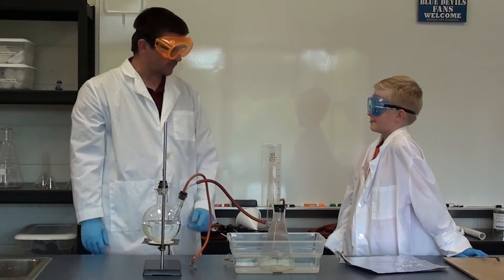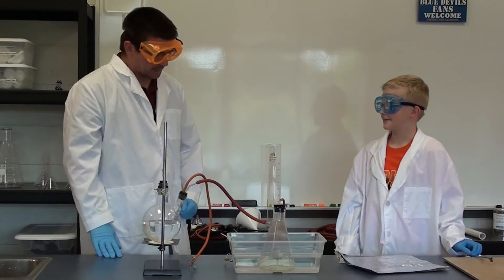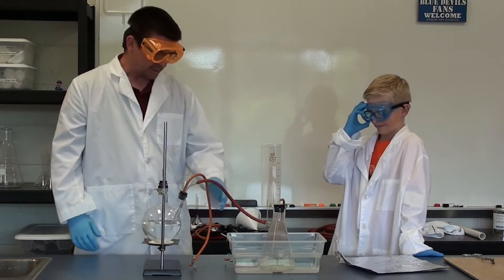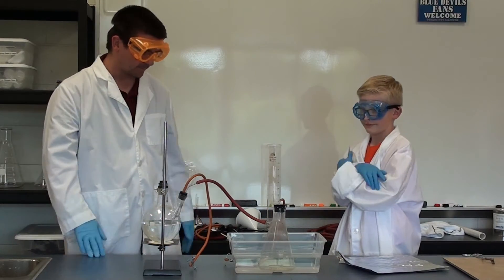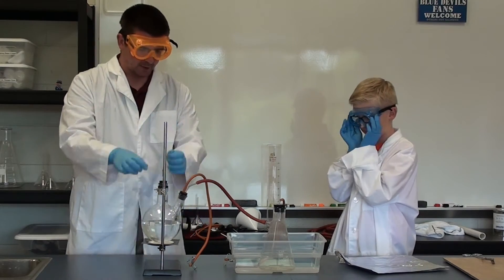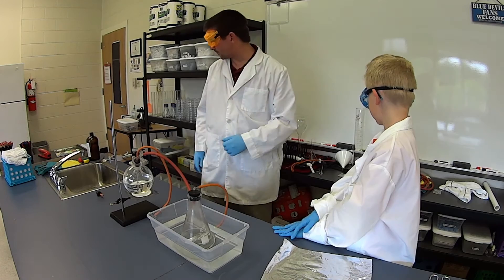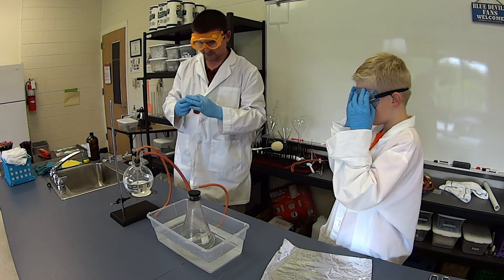Now it's going to sit there for a couple minutes. The acid is going to begin to dissolve the aluminum foil — eventually there won't be any left. As it's happening, it's going to break apart the hydrogen atoms from the hydrochloric acid molecules, and the hydrogen gas will come out through here. It's going to bubble through this water here just to get any acid fumes that may come out, and come back out the top. We need something to catch that, so we're going to put a balloon on top to catch the hydrogen gas.